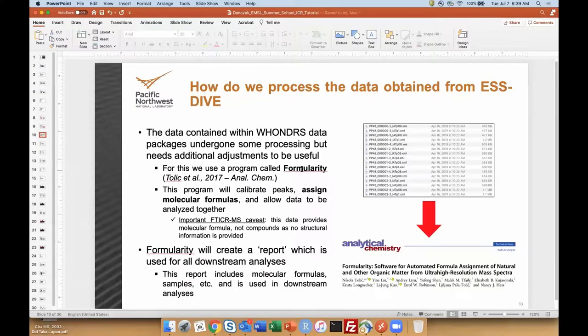Alignment is then a step which is questionable. It's necessary at the moment, but it's a complicated step. We basically take a moving average of all of the masses and start combining masses, combining entries, detected peaks, below some common threshold. There's nuance to it, but that's ostensibly what it is doing. Using these then finally derived masses, we can then assign molecular formulas according to that database file that you are downloading.